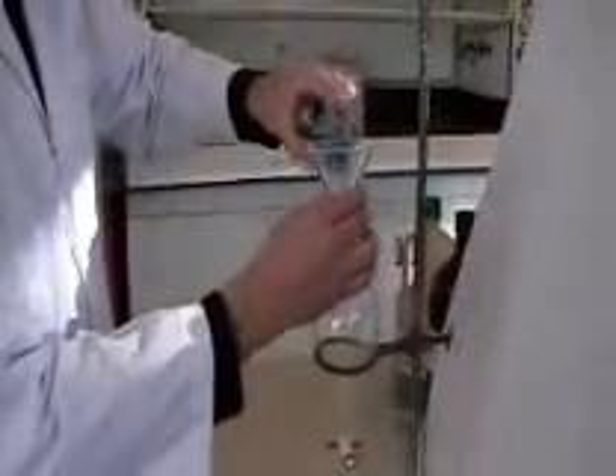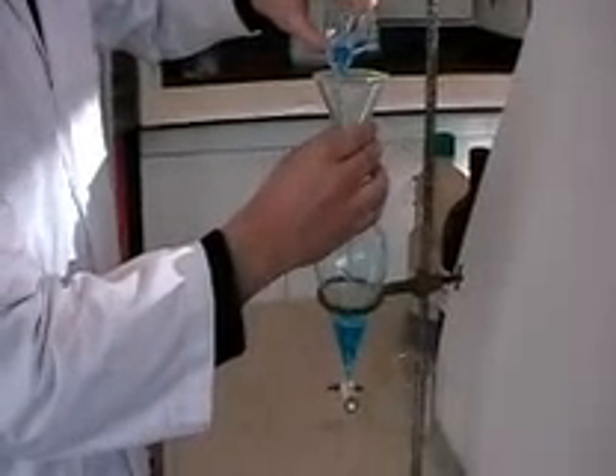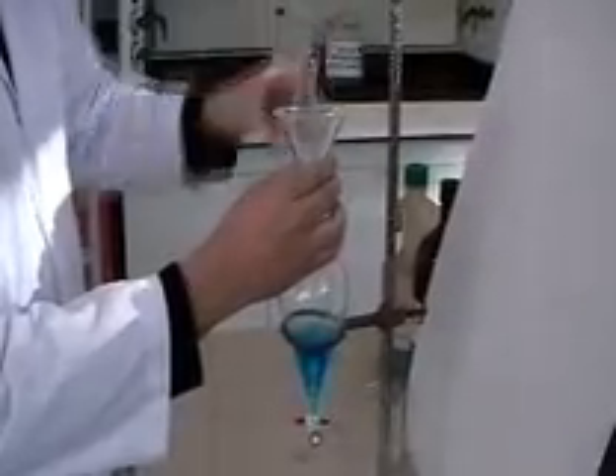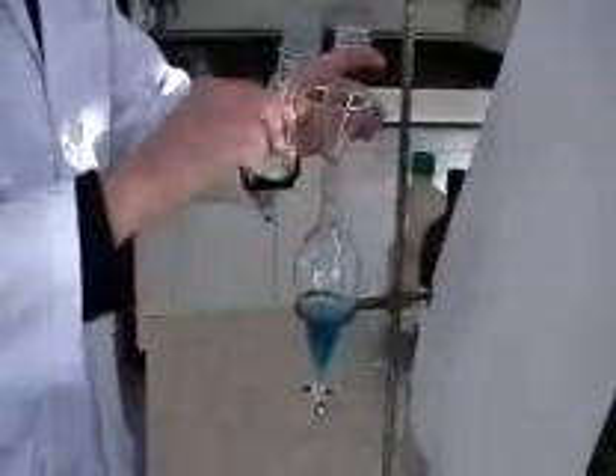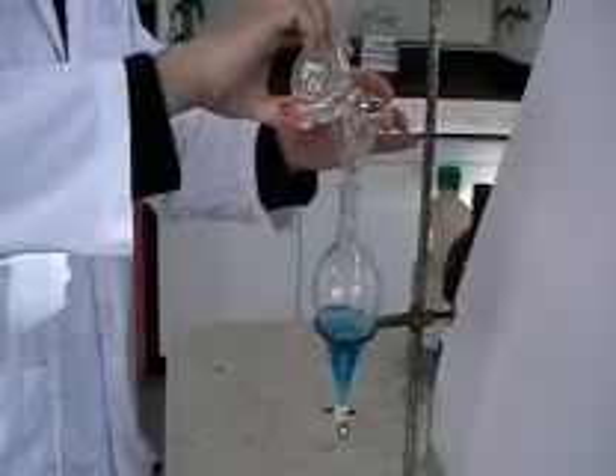We're just using an aqueous solution and some diethyl ether here, but the liquids can be anything. You gently pour your liquids in, and sometimes you can lift the funnel up to avoid any bubbling of the liquids as they pour in.